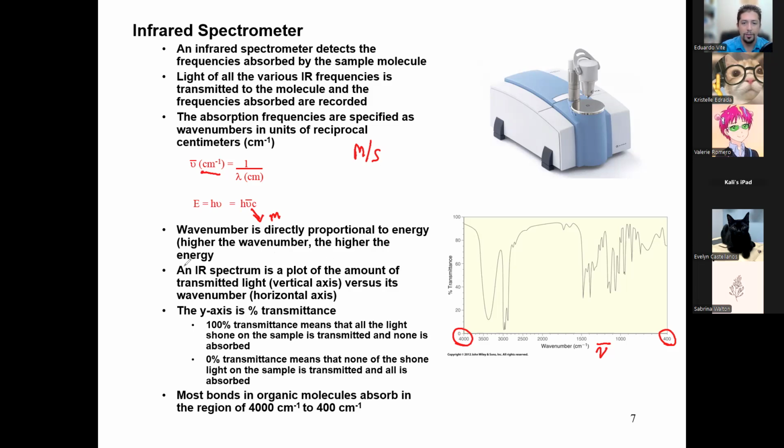Okay. So this is what the spectrum actually looks like. We call this a spectrum. So when I tell you to look at the spectrum, I'm talking about this graph. If it is plural, it is spectra. Because of Latin: Latin words that end with um are singular, Latin words that end with a are plural. So we just stole that because English is a combination of everything.